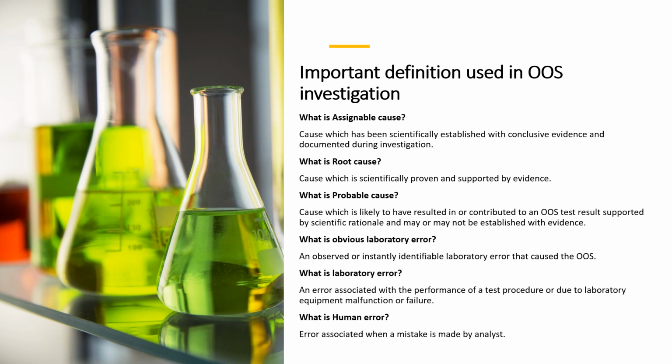Next is, what is human error. So an error associated when a mistake is made by the analyst. So it may be that the analyst did not follow the method of analysis, which may include pipetting error, weighing error or dilution error.